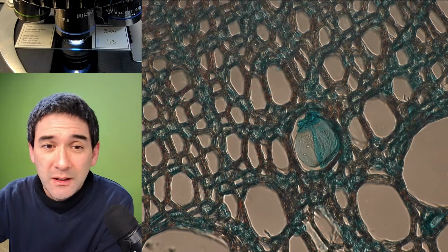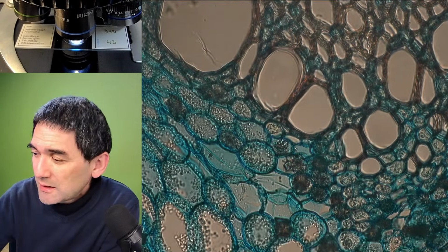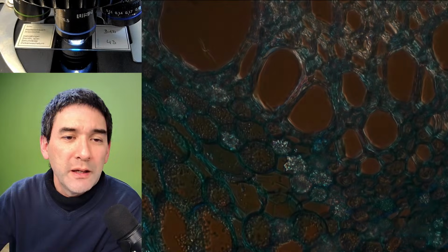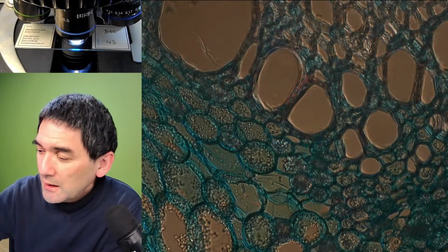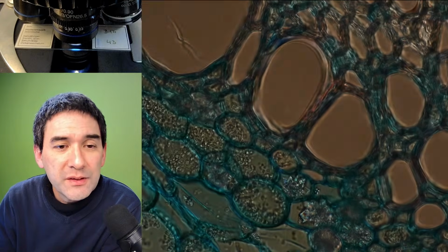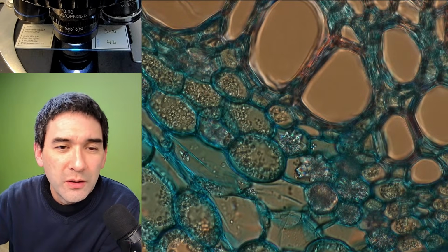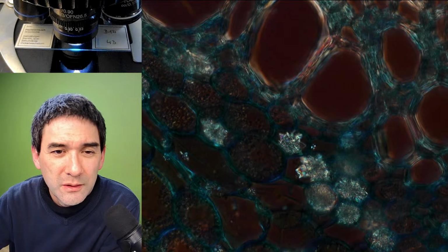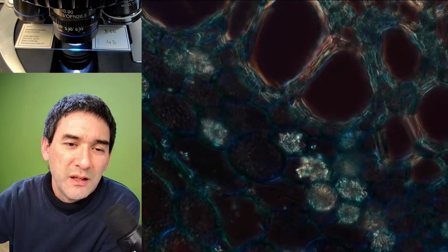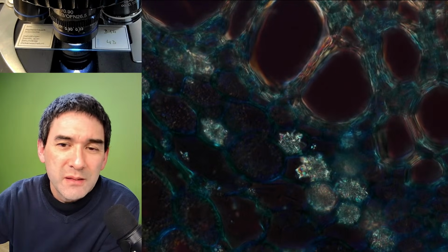Are they really crystals? I don't know. It could be. It does look like it. Let's try it again. You see, usually if something starts to light up like this, okay. But I want to show you something else here. I do have some other slides that look very much like crystals, but I don't know which ones they are or what they are. Look, if something lights up like this and has so many sharp corners, this is a strong indicator that this might be some kind of crystal.